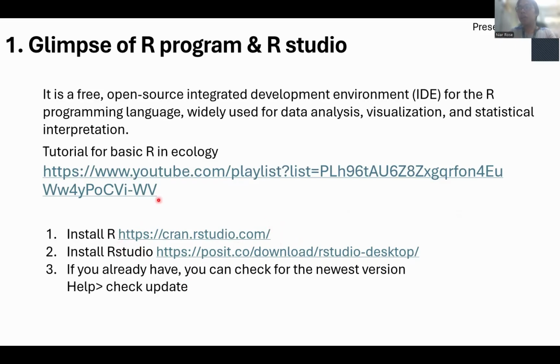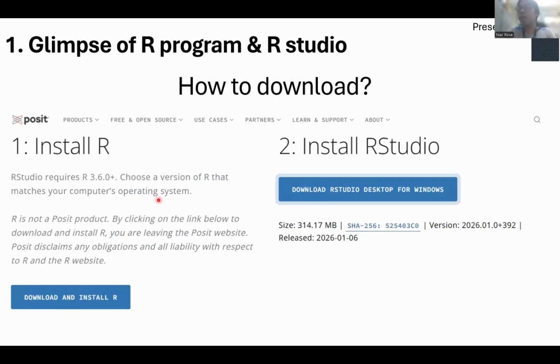And here I also give you a tutorial of basic R, especially for ecological usage, because in this online training, I'm not going to tell you a lot about how to use R. As I mentioned before, you need to install R first and then install RStudio, which are two different things.